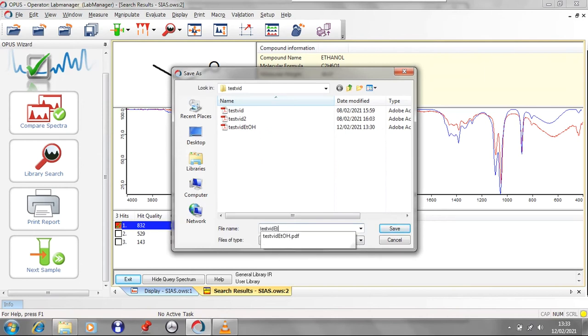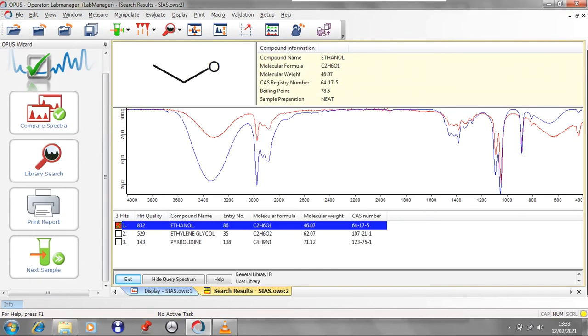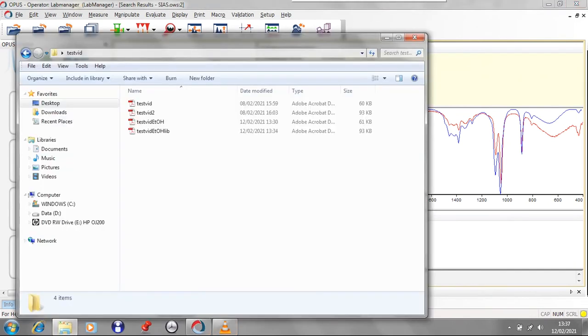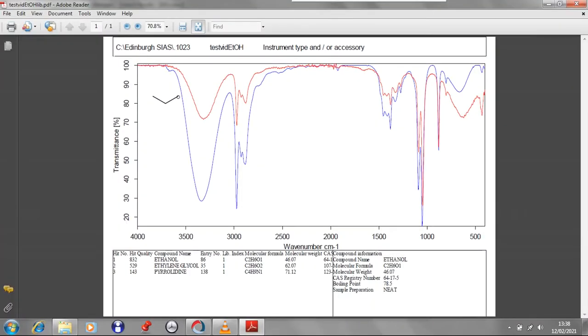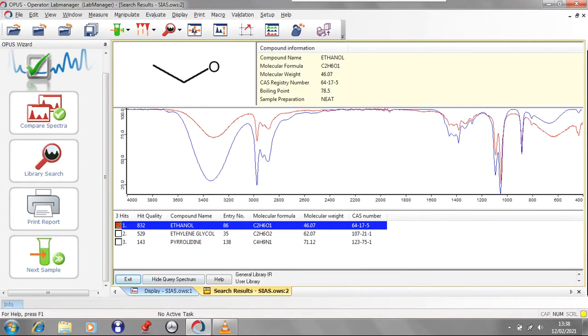Note that if you save the image file at this point, it will save both your recorded spectrum and the library file analysis. We can see this by opening the two PDF files in turn. The first has only the spectrum you measured, and the second includes the library matches.